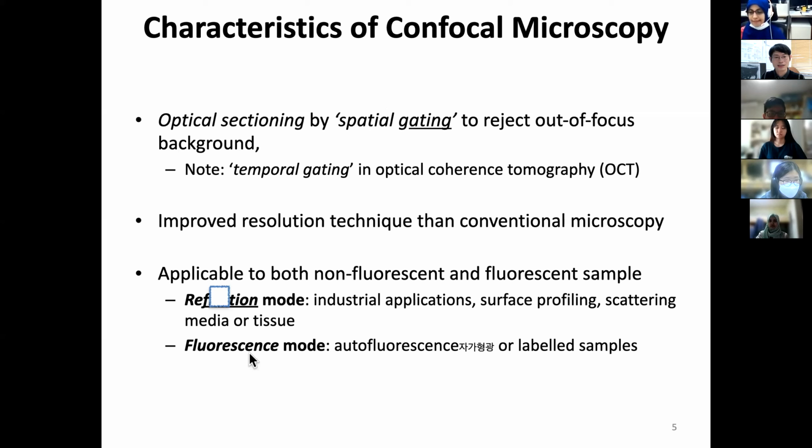So especially, let's get the first fluorescence, which always you need to have a fluorescent label, or the biological sample. Many times it has also autofluorescence itself. So what if it's not the case? Confocal still can provide some kind of contrast based on light scattering. So that can be really good.